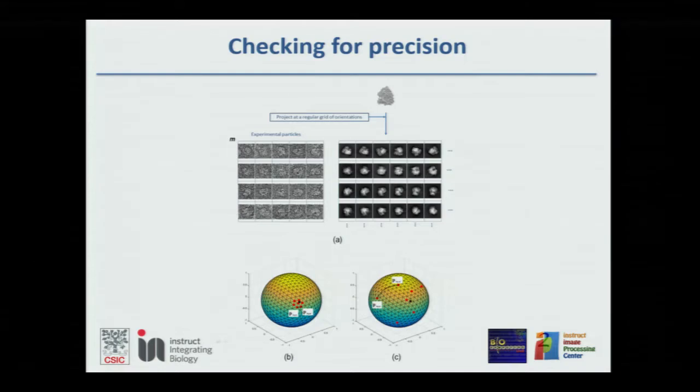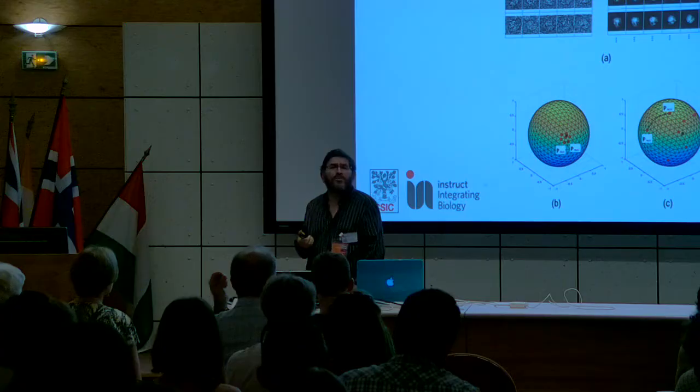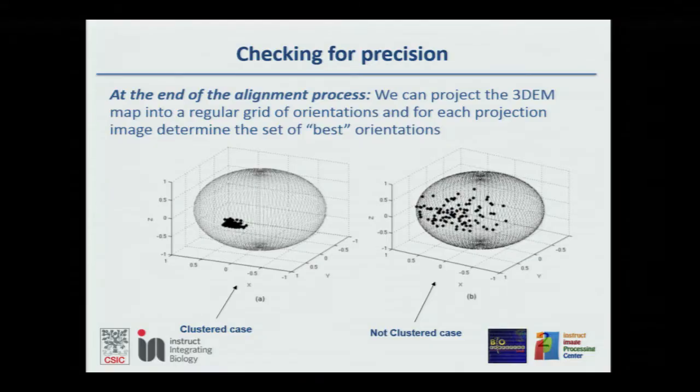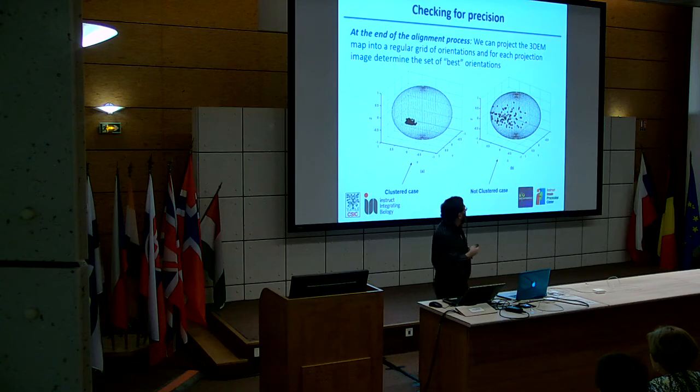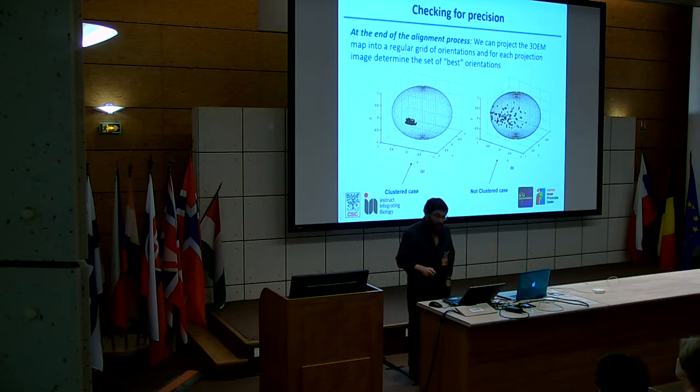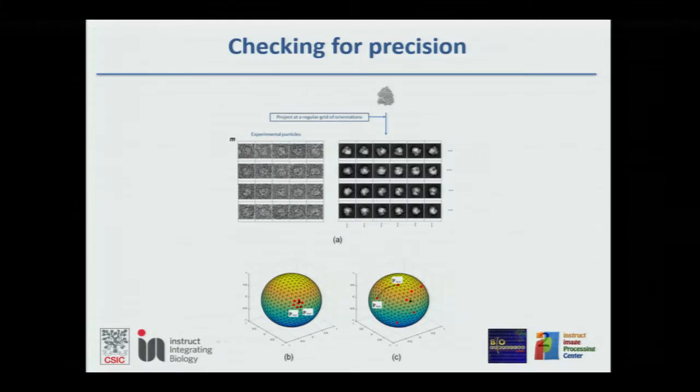Why? Because each of these views, which are the electron microscopy projections, has an intrinsic level of information in terms of telling you the 3D orientation. So this simple idea, that at the end of the process we wanted most of your solutions about different orientations to be very similar, had a problem of normalization. Intrinsically, each orientation had a different level of information. And well, we went into that problem.